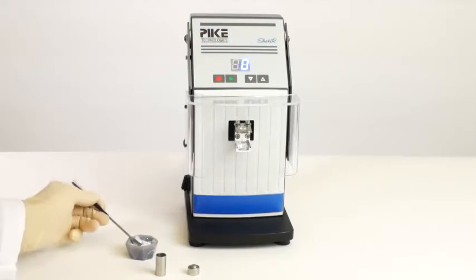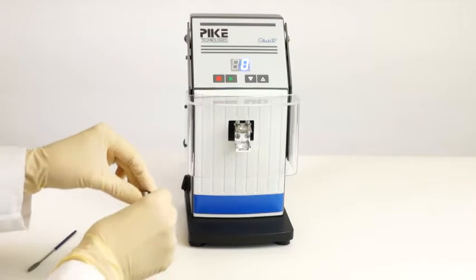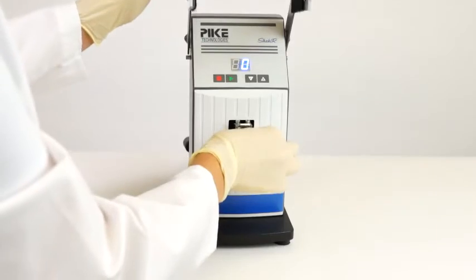Homogeneity. Samples should be uniform and well-mixed. Non-homogenous samples will lack reproducibility. The shaker may also serve as a mixer when the steel ball is not used in the vial.